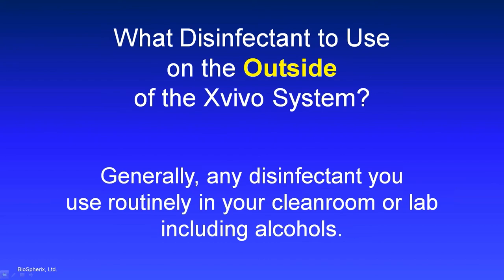Oh, I will say before I leave this that we did have one customer that came to work in our Xvivo showrooms once that wore heavy makeup. Now, you can't wear makeup in a clean room, but she wore makeup to come work here. And by the end of a work day, the Xvivo system glove front was wearing a lot of that makeup. People are people, and people sneeze, and they don't want to share germs with the next person that's going to come work in that system. So please feel free to clean the outside of that glove front frequently with alcohol or another convenient disinfectant.